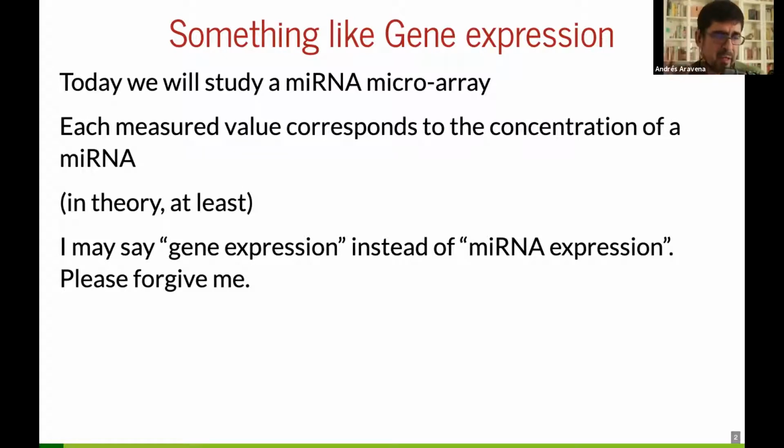So this is a microarray, an Affymetrix thing, with oligos designed for microRNA that has been identified in the literature. It's a commercial platform, so it's well defined. You find it online, it is well established. At the end of the day, what we get from the process is a number for each microRNA, which corresponds to the expression.